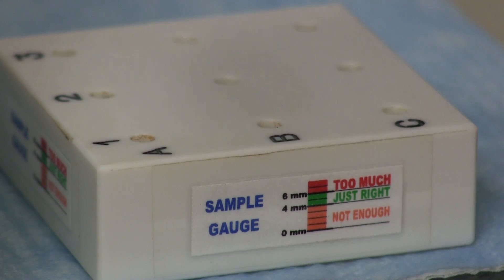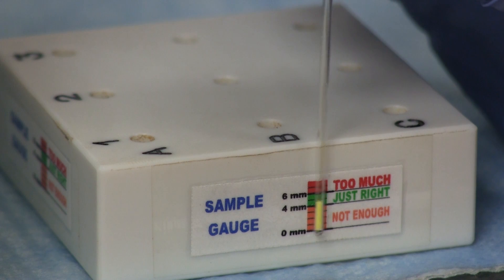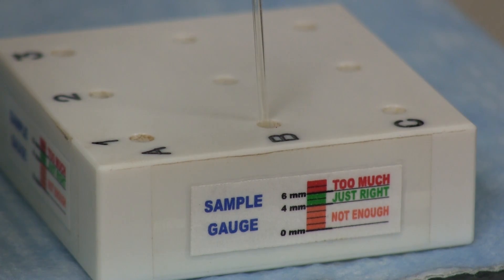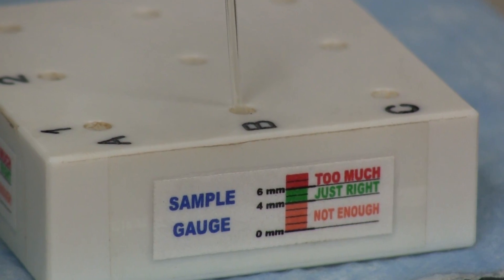The size of the packed sample should be between 4 and 6 mm. A gauge is available on the side of the capillary tube rack to allow you to judge the depth of material at the bottom of the capillary tube.